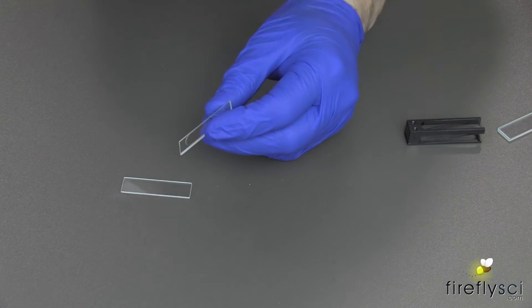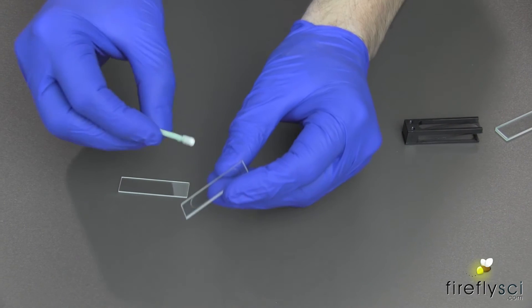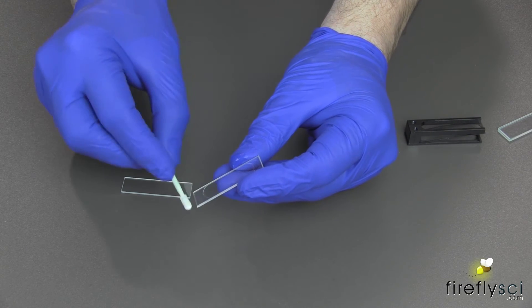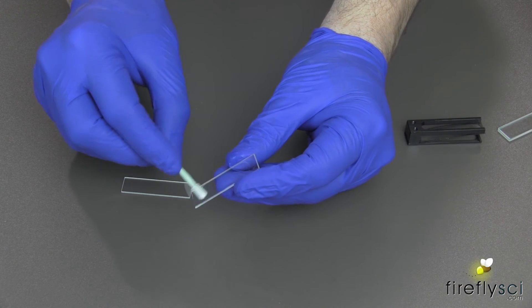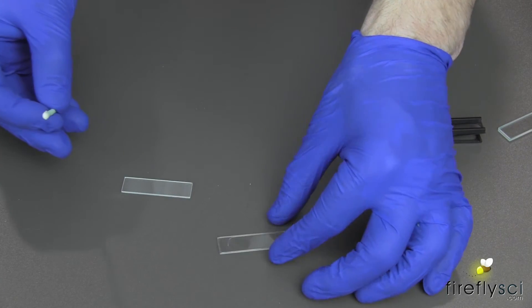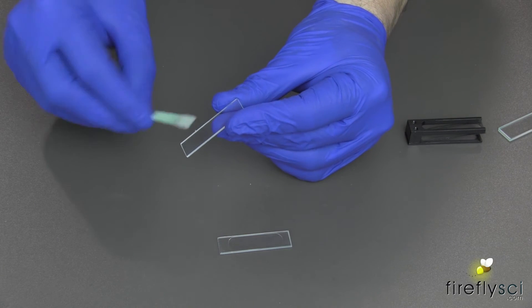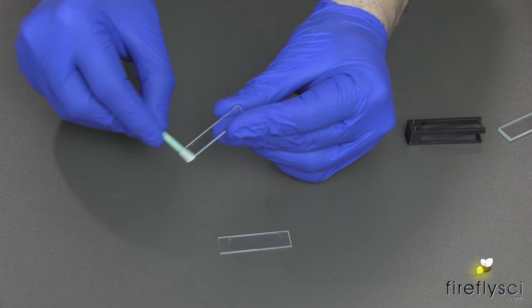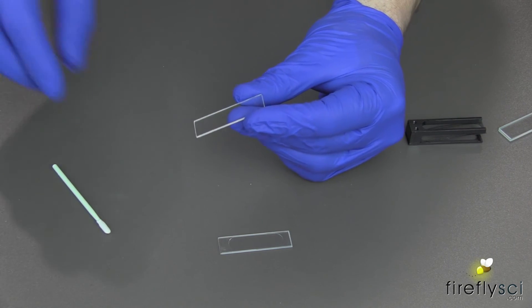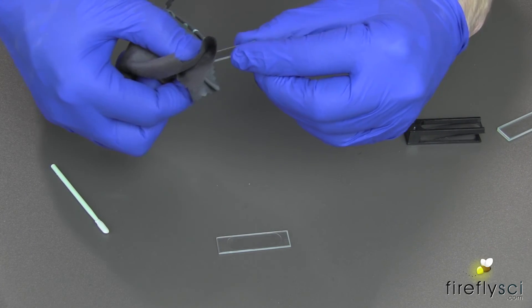For tough stains, you can use a cleaning swab with a little bit of ethanol alcohol and just go right over the windows just like that. This is the groove plate we're cleaning right now. Now move on to the cover plate — same thing, just gently go over the windows. Dry it with a lens cloth or you could air dry it on a cuvette rack.